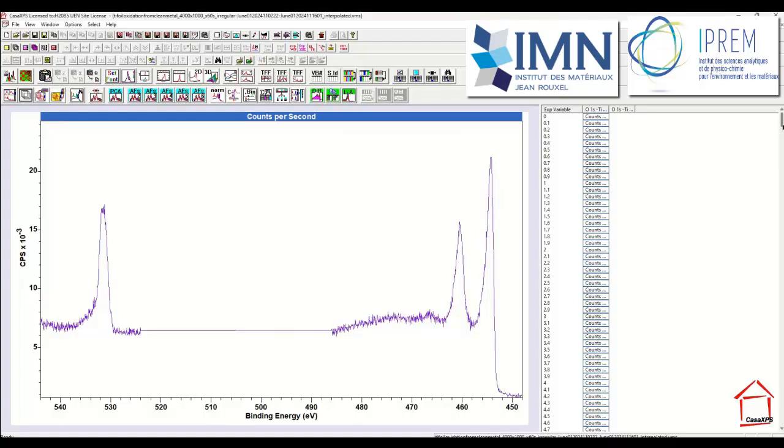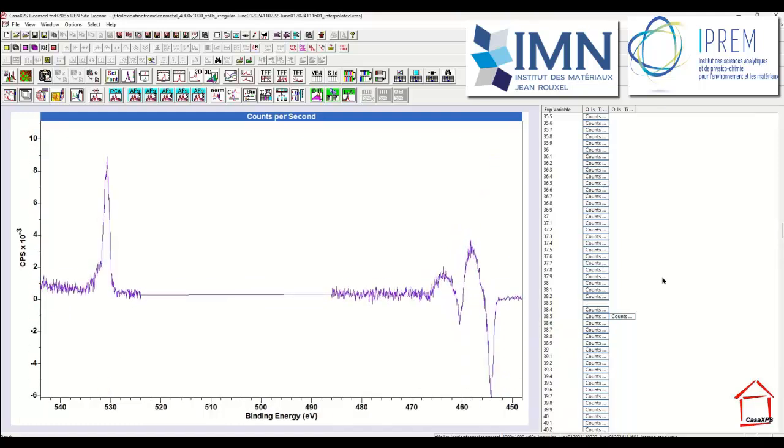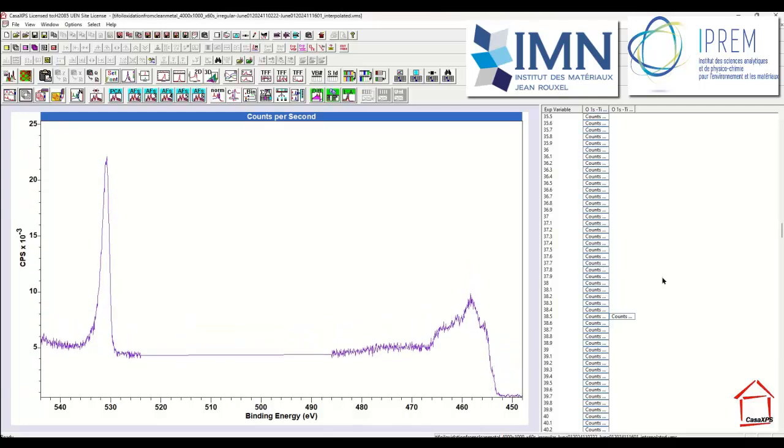And there it is. So if we scan down and look for that VAMAS block, it's still selected. If I use the arrow key and step left, I return to the column of different spectra, and I can carry on down my list looking for a potential alternative shape to the data. And there we have something that looks plausible.